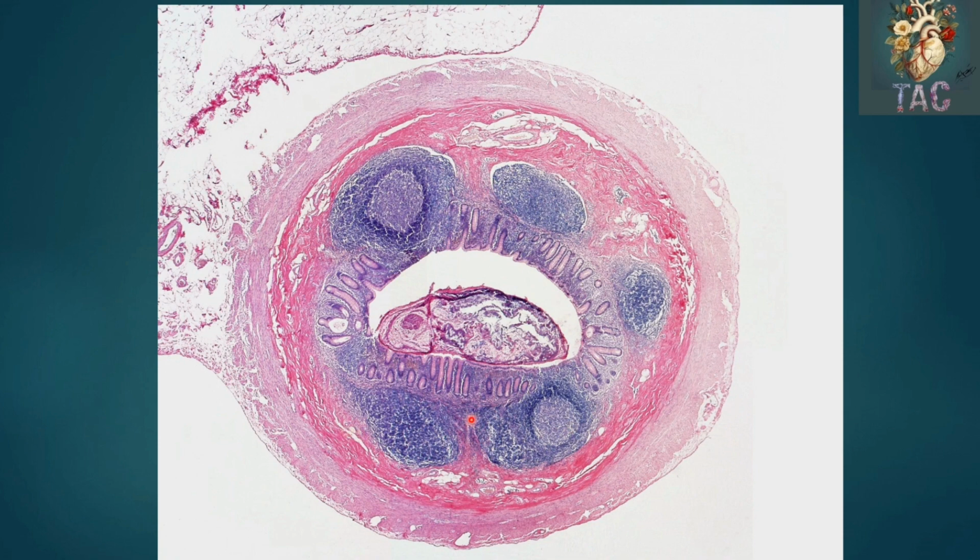So these lymphatic nodules are so many that they even breach the muscularis mucosae, and they are present in the submucosa in certain sections of the appendix. You cannot appreciate any difference between the mucosa and the submucosa. The whole space will be covered by the lymphatic nodules and lymphocytes. Another important point, as I have already mentioned, is that this is present at the junction of both small intestine and large intestine. So the mucosa has an arrangement like that of the large intestine, but the cells which are present in the glands resemble that of the small intestine.